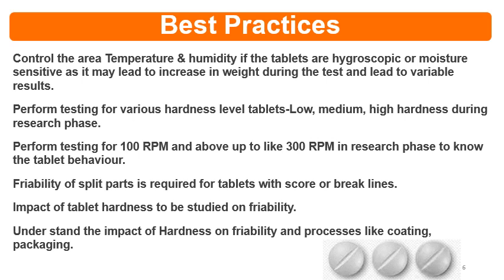Then the impact of tablet hardness to be studied on friability. It is very important. Sometimes if you increase the hardness beyond a certain range for some of the formulations, then that increased hardness will not give you good friability, but the tablet will show capping.